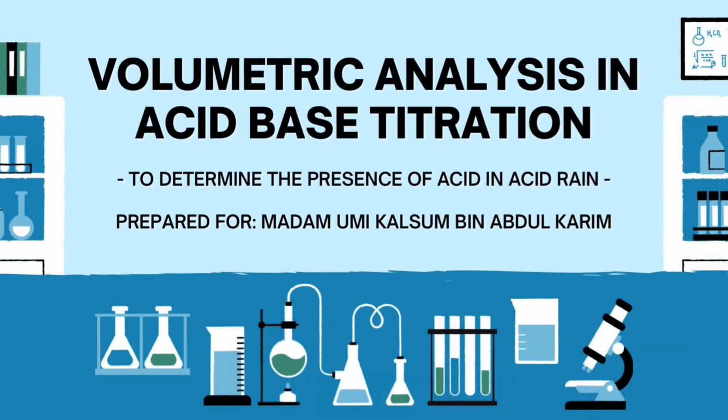Assalamualaikum and hi everyone. So today we would like to present about volumetric analysis in acid-base titration, which is the application to determine the presence of acid in acid rain.